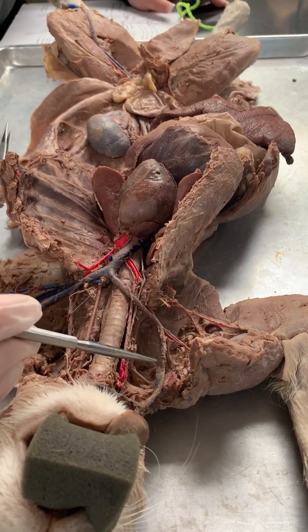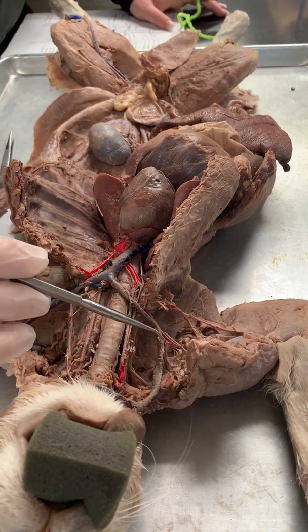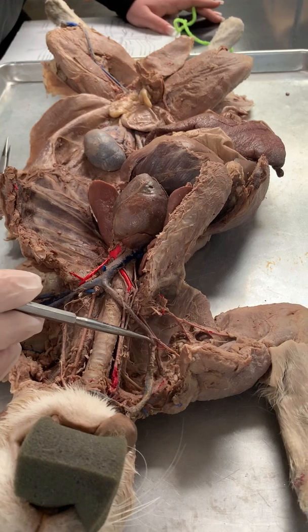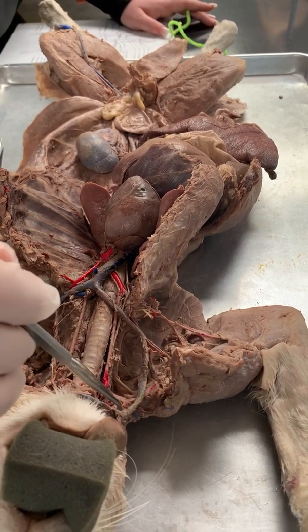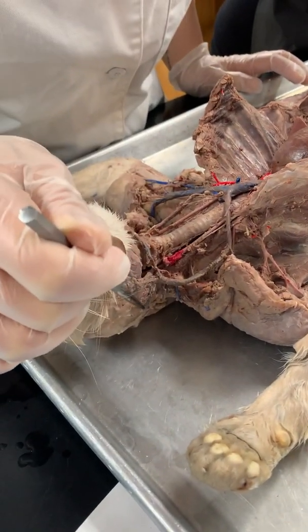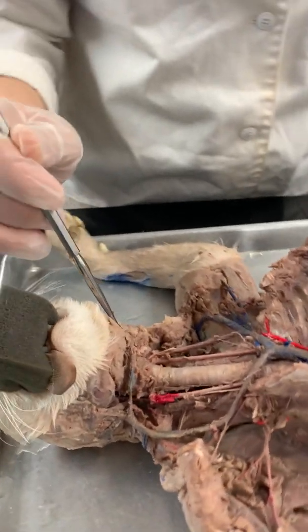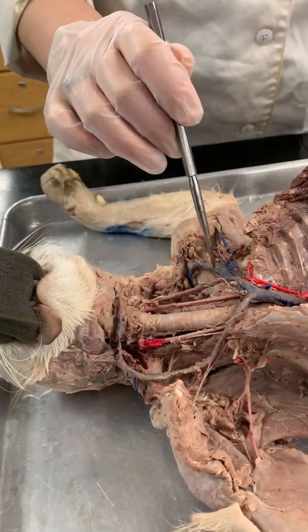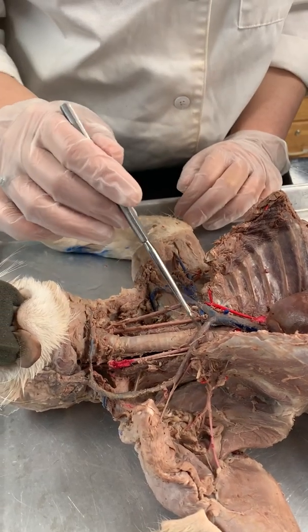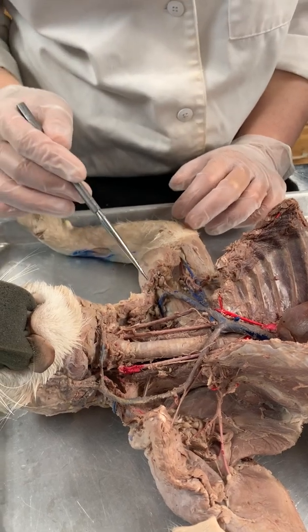I like it best on this side, right? And I'll talk about the trunks that come off the external jugular on the other side where it looks like it's cut. So external jugular, and here is the anterior facial vein, and there's the posterior facial vein. This is a nice transverse jugular where it would attach to the left external jugular if we had one, but we don't. So here is the brachiocephalic vein on the left side.